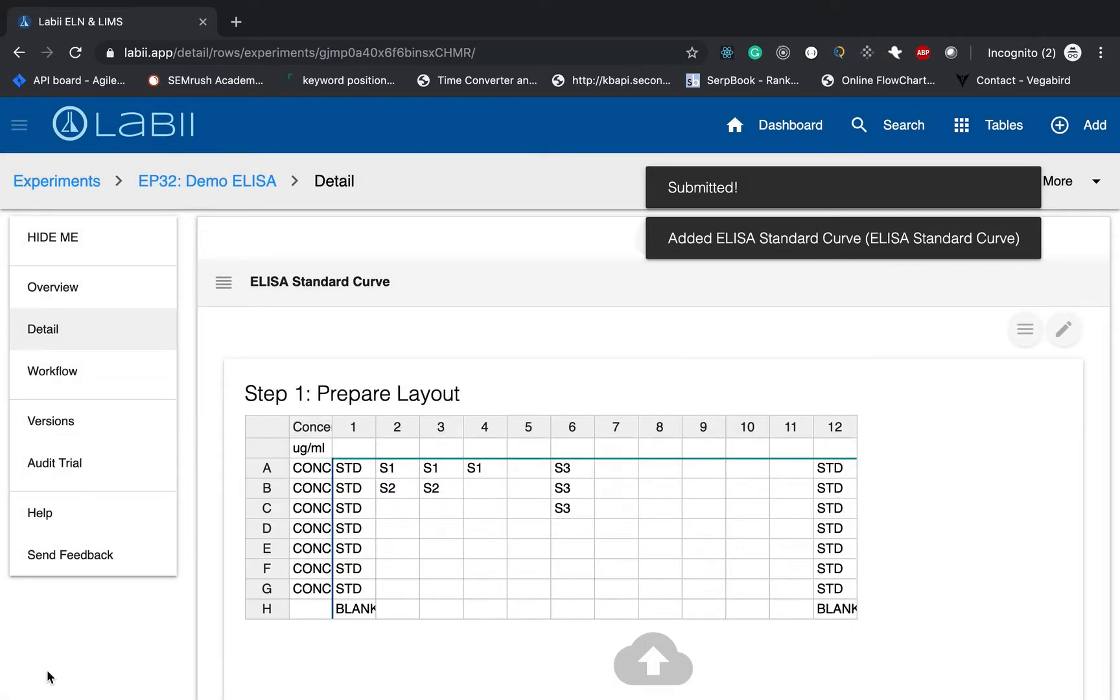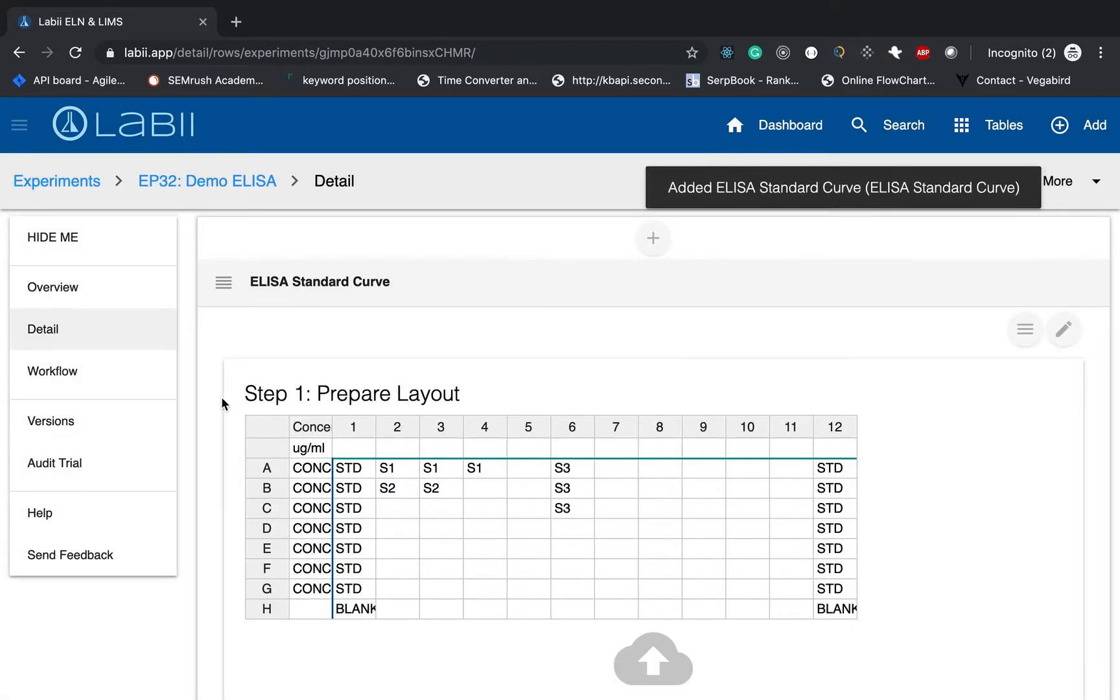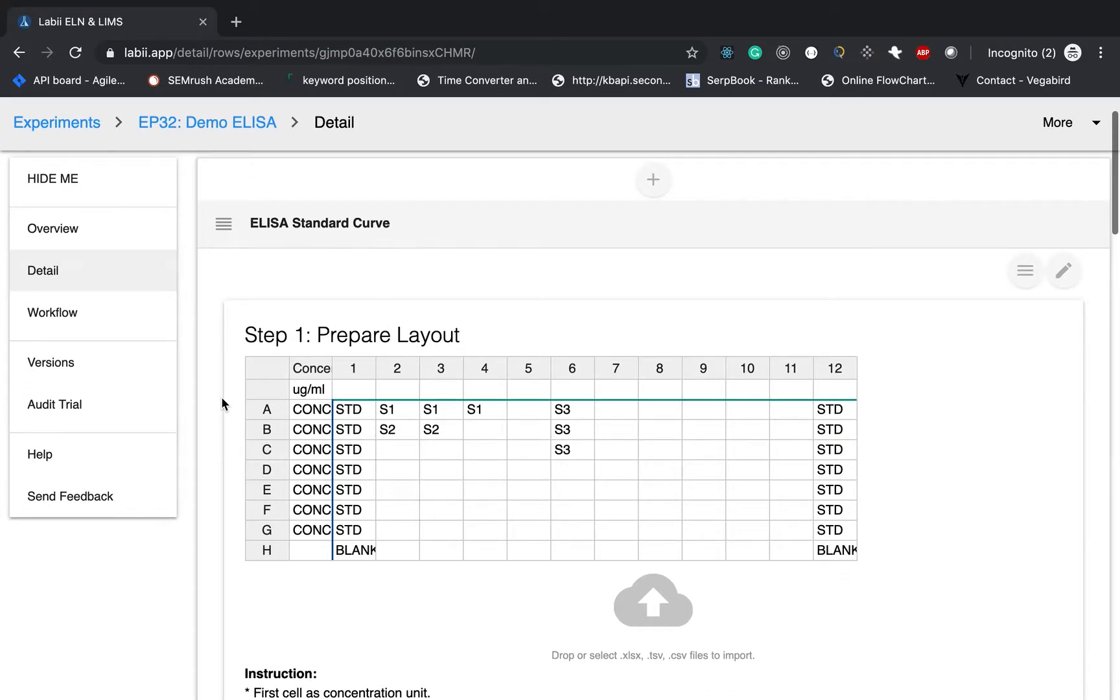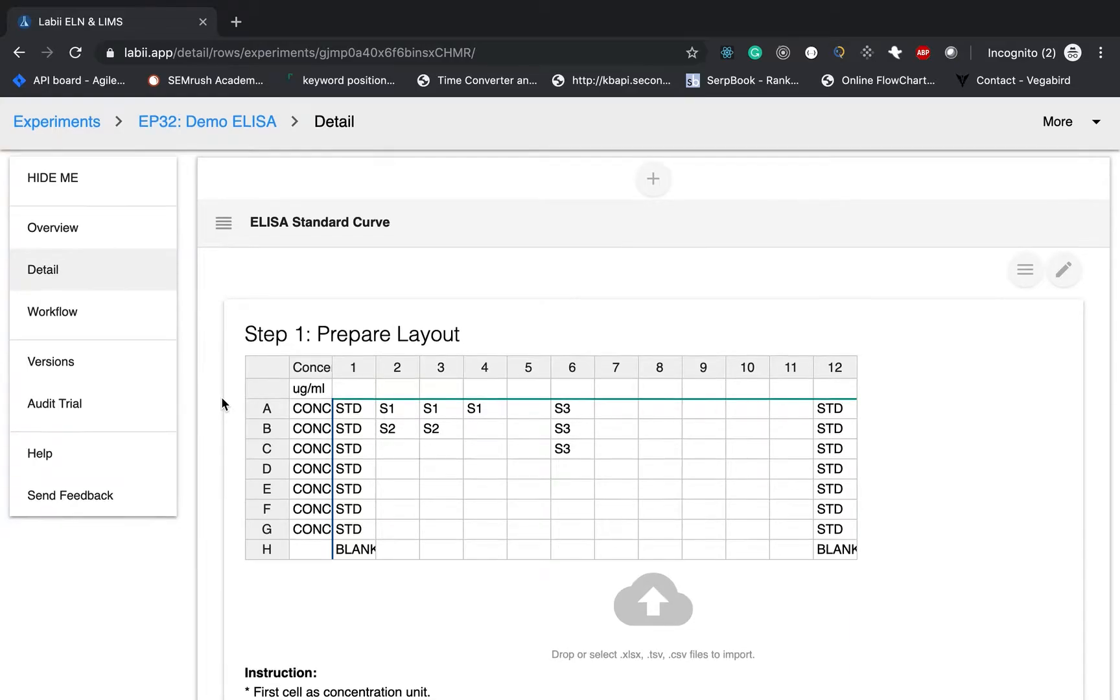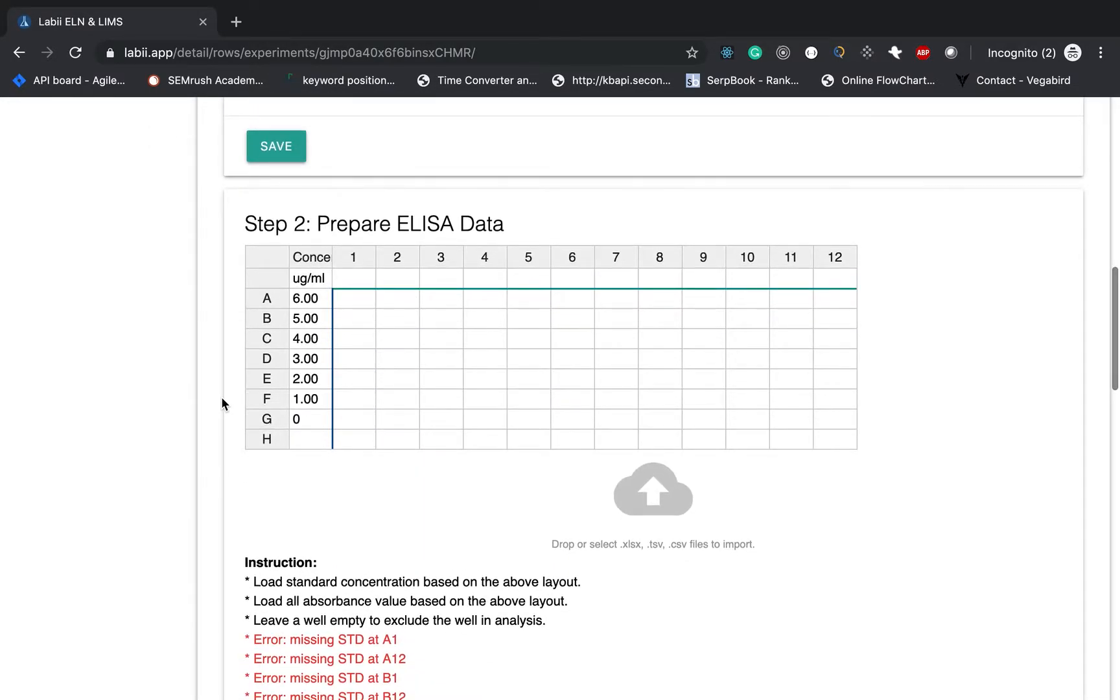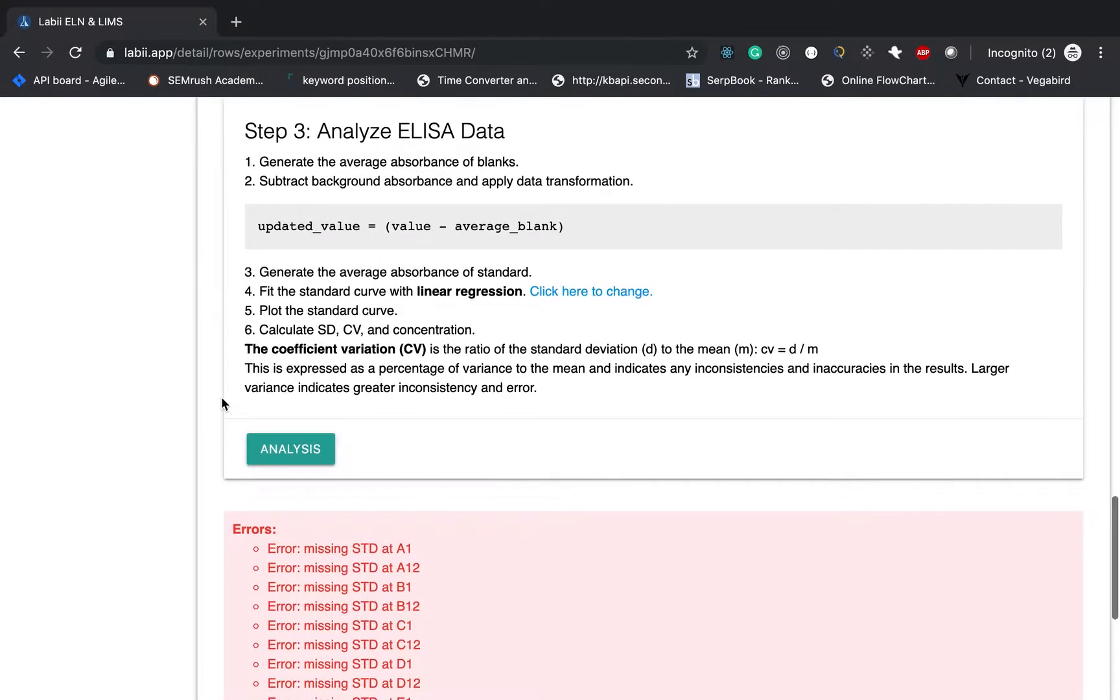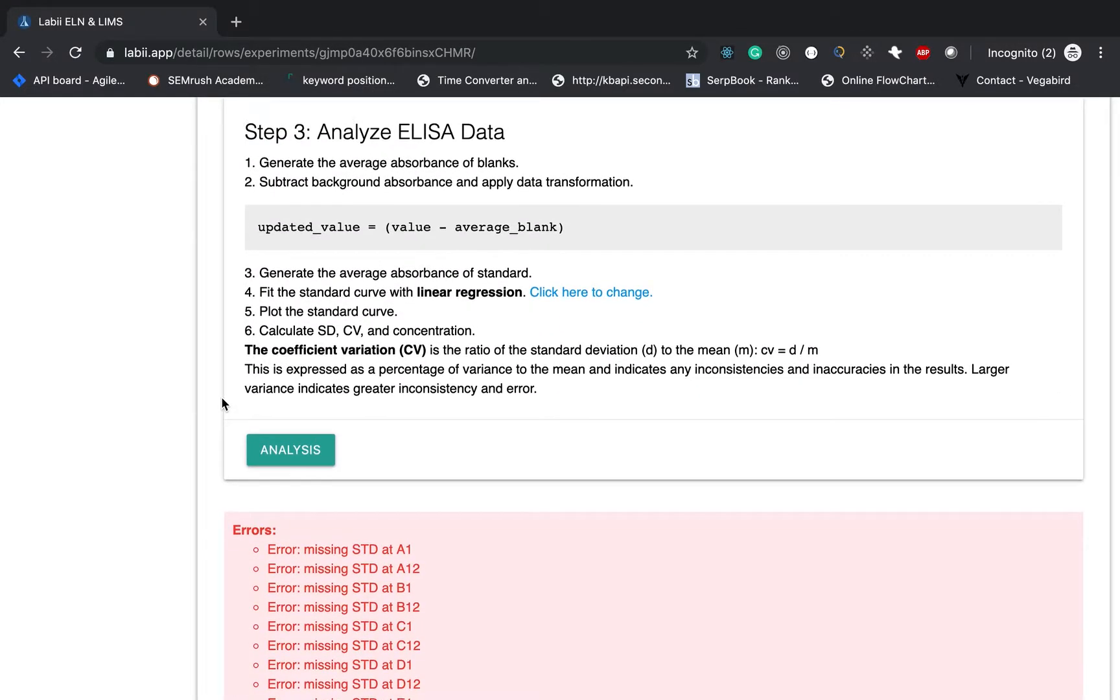Then you will notice it will give you the interface. And this ELISA standard curve analysis in Libby can be separated into three steps. Step one, prepare the layout. Step two, prepare the ELISA data. And then the last step is just analysis.